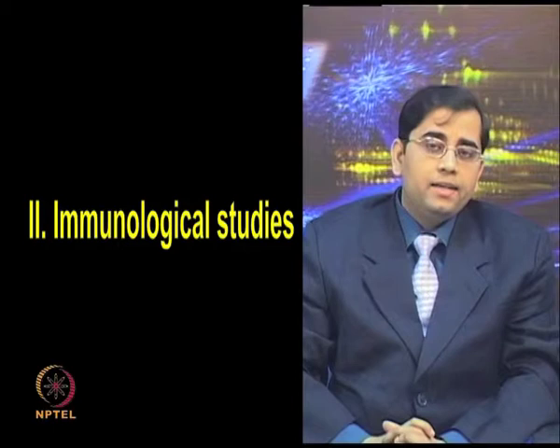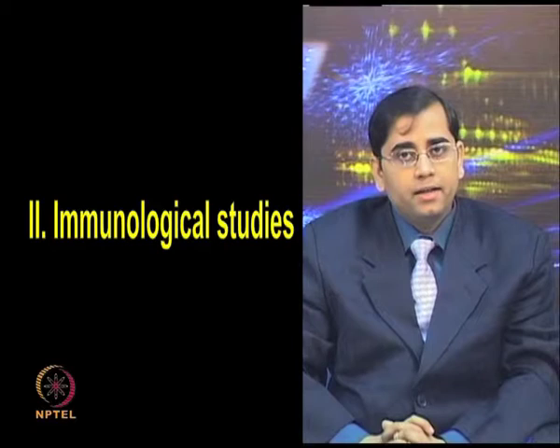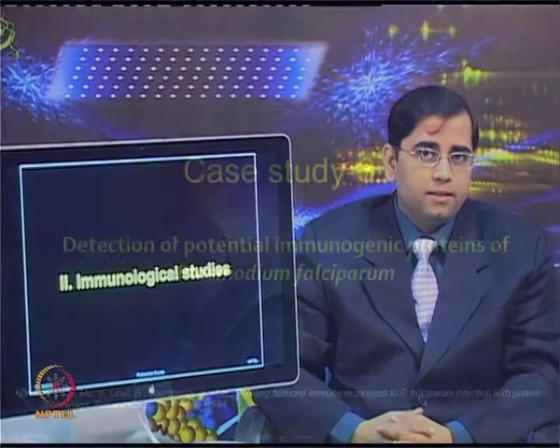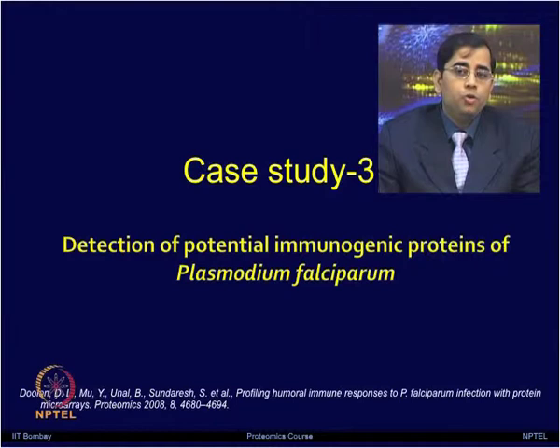So, on one hand, several studies have shown application of protein microarrays, including cell-free based protein microarrays, for biomarker screening. Several studies have also focused on the immunological studies. This is case study 3, detection of potential immunogenic proteins of Plasmodium falciparum, a study performed by Doolan et al.